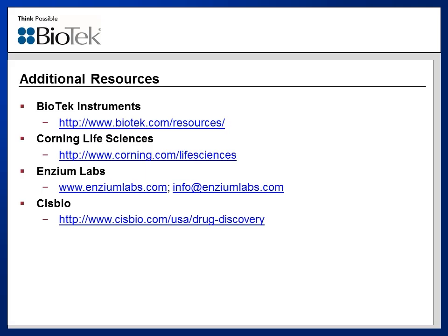For centrifugation, I usually would spin the plate for just a matter of a minute or two, typically at about 200 times G, again in a swing bucket rotor type of centrifuge. This obviously can be optimized depending on the type of centrifuge that you have in your lab, and also depending on the type of cell models that you're using.